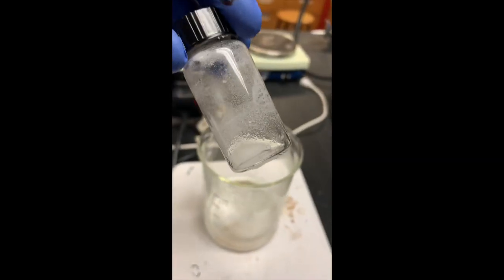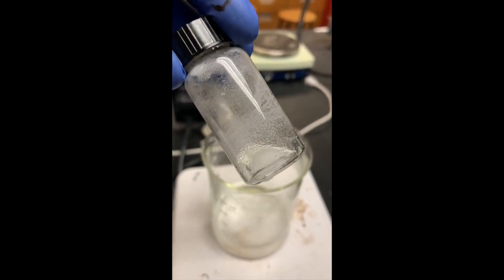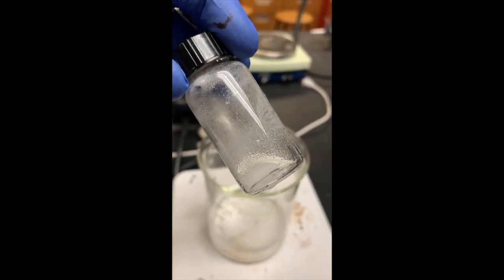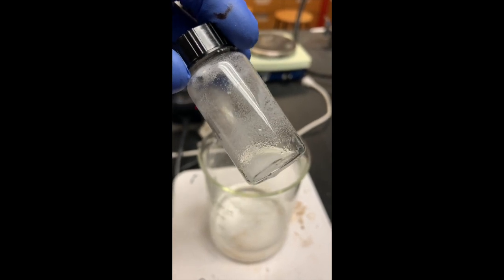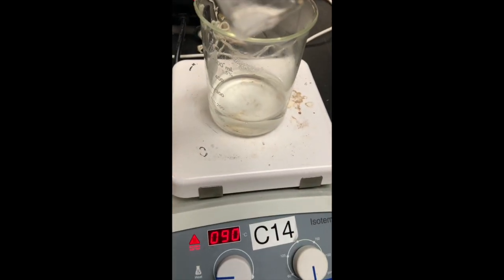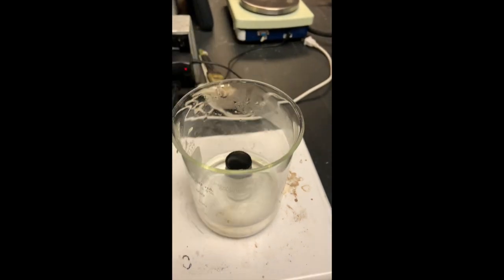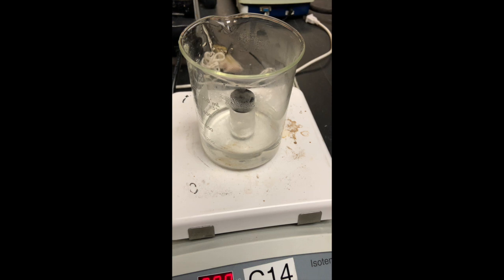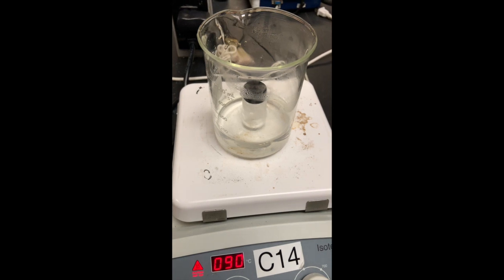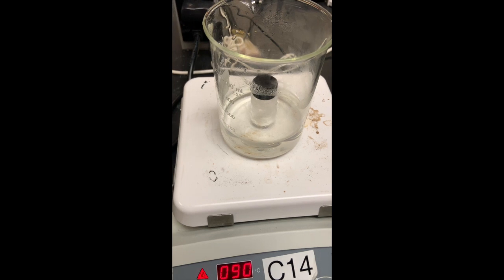In the fume hood, I mixed my 0.28 grams of salicylic acid powder with 0.6 milliliters of acetic anhydride and 2 drops of concentrated phosphoric acid. So I swirled it around, and now I'm going to put it into this hot water bath and just let it stand there. I'm going to leave it for 8 minutes, and I'll occasionally swirl the vial just to make sure all of the salicylic acid dissolves completely.